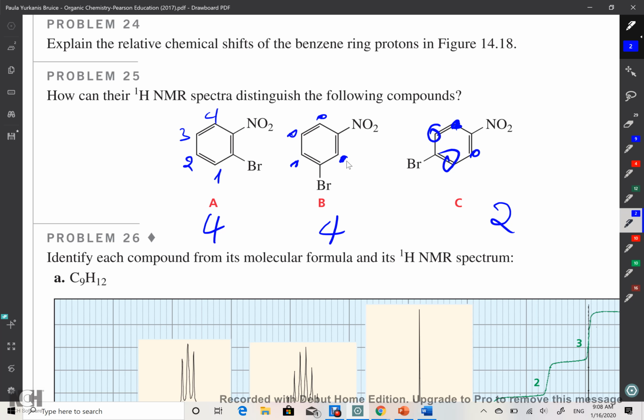Galena, does that make sense? I knew you would say that. I knew she would say there's a double bond there. So what would a double bond do? It might extend the coupling up to 4 bonds. That's called long-range coupling. So technically, it will be a doublet if your instrument is weak. If the instrument is strong, then you would see the long-range coupling.